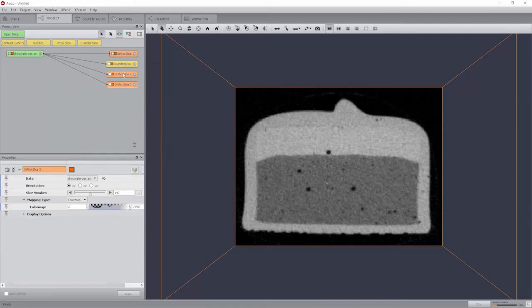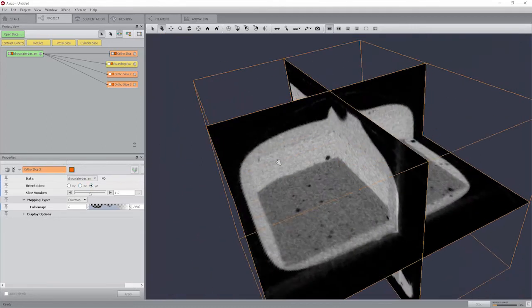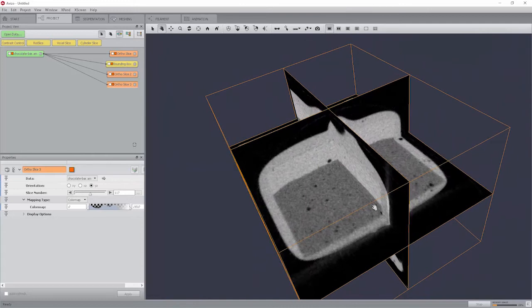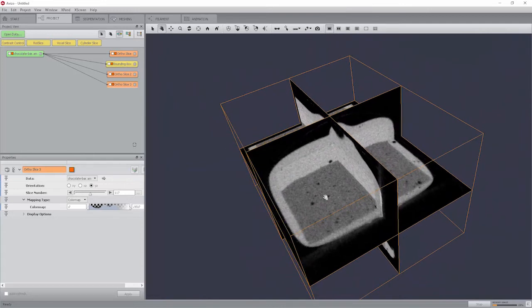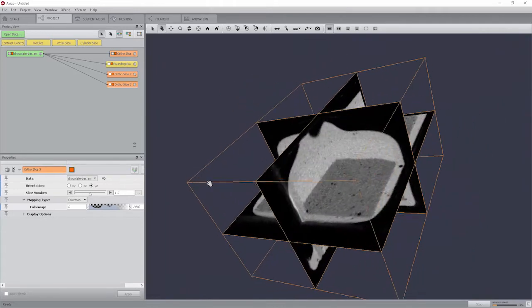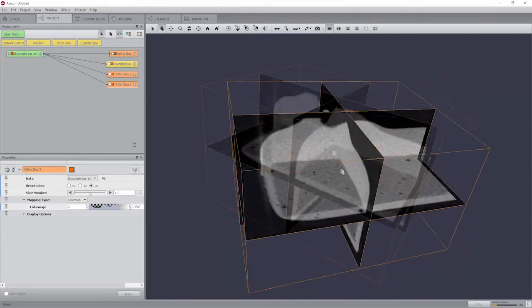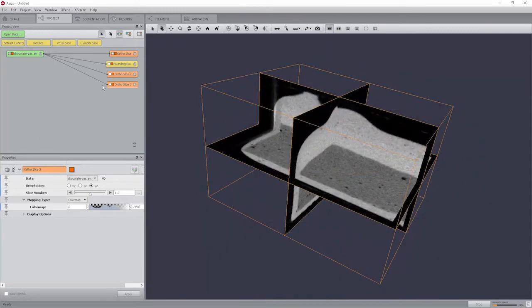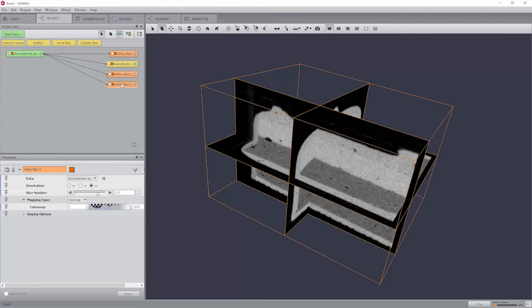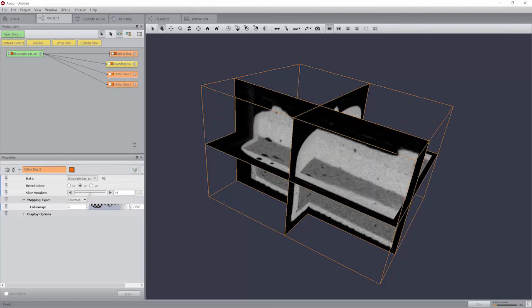Select ortho slice 2 and press XZ in the orientation port. Similarly, for ortho slice 3, choose YZ orientation. Rotate the object in the viewer to a more general position. Change the slice numbers of the 3 ortho slice modules in the respective ports or directly in the viewer.